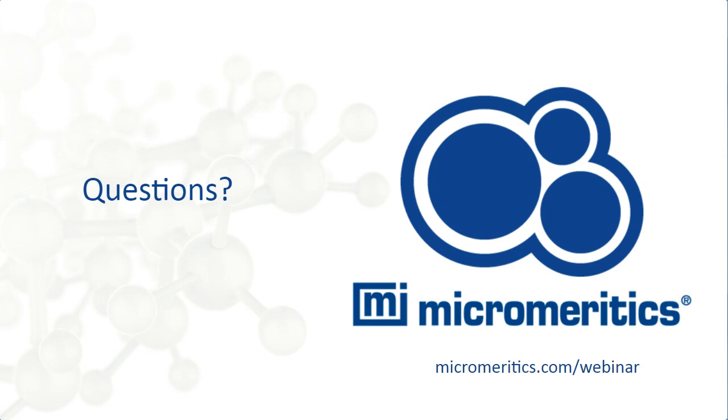Okay, great, thanks. And again, I've had a few questions along similar lines. In a real world scenario, and I appreciate this is a very vague question, how can caking impact any process performance? Let's put it that way. So if you have caking or crusting occurring in a process, it can be important to know exactly by which method that caking or crusting is occurring, so that if it's undesirable for that process, you can manage it effectively.